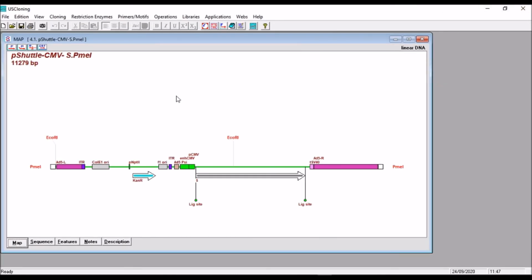Okay. In the next step, we have to transfer the S gene from this linearized molecule to the adenovirus vector pADC1. This will be done using the powerful Escherichia coli recombination system. And in this application, we have first to create the appropriate recombination sites.